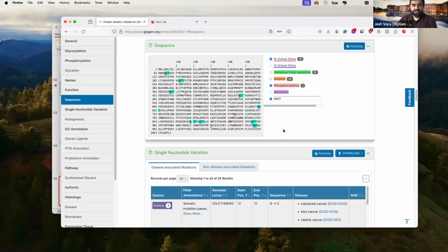So site search provides an interesting feature. If you just have a sequon or a motif, let's say for C-mannosylation, or there are some fucosylation, like O-fucosylation, that are around a particular motif or on the motif, we can use this site search and try to find proteins that fulfill this condition.